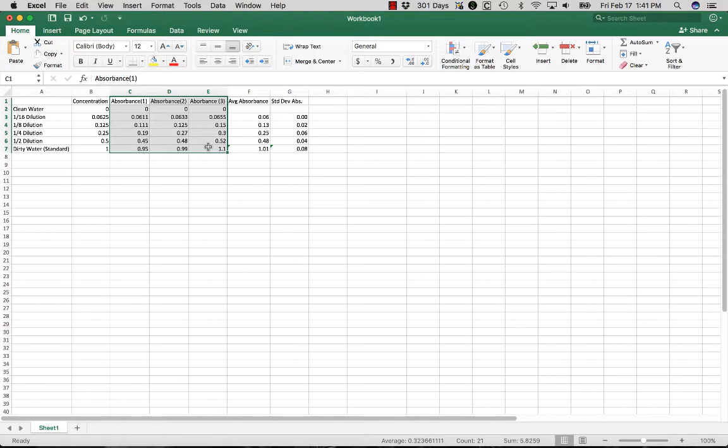If you go into the notes or the video and look back on the day that we talked about spectrophotometry, we talked about how you define transmittance, how you define absorbance. And so if you look at that, you can basically use your photometer to capture some data based on how much the sample that you have is absorbing light.